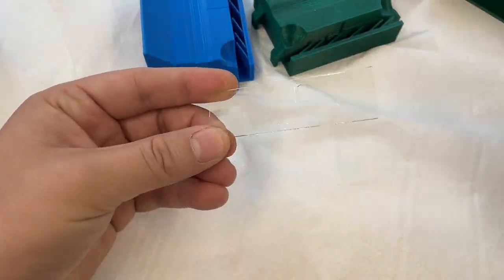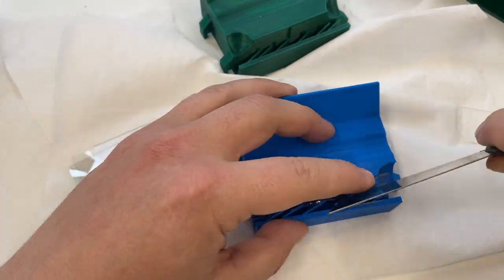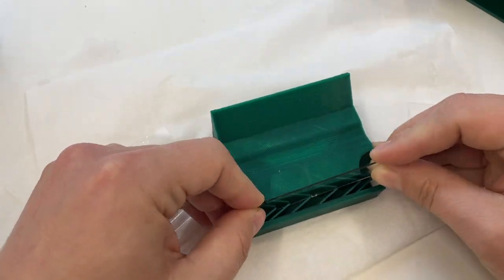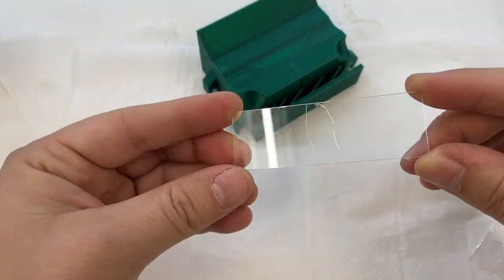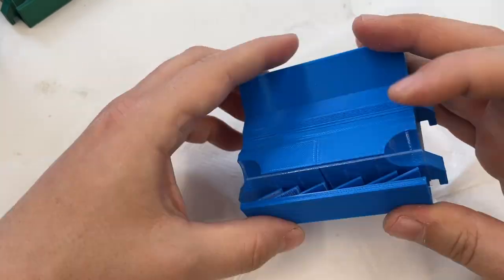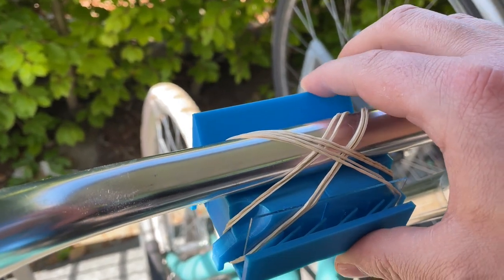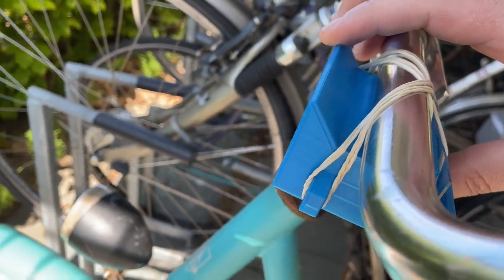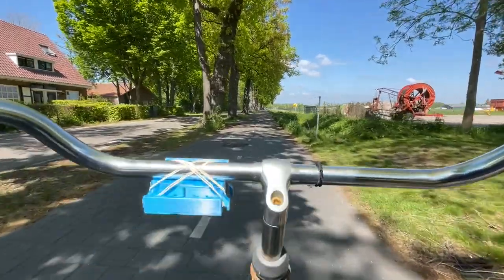You can naturally make many more for giving to friends, family, and so on, for collecting air particles in other places of the world. You can ship them, and then you can see the distribution of particles in different parts of the world. Simple and easy. Then you just attach it on your handlebar on your bike. We're using some rubber bands, and well, just bike around.